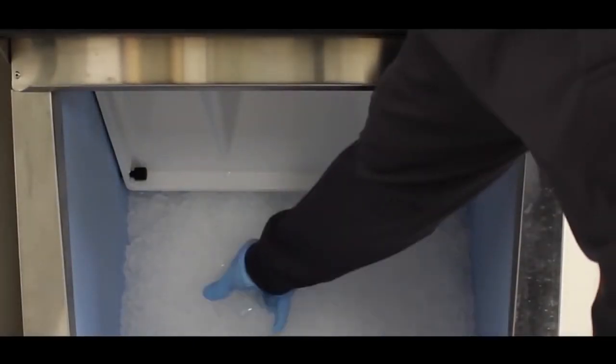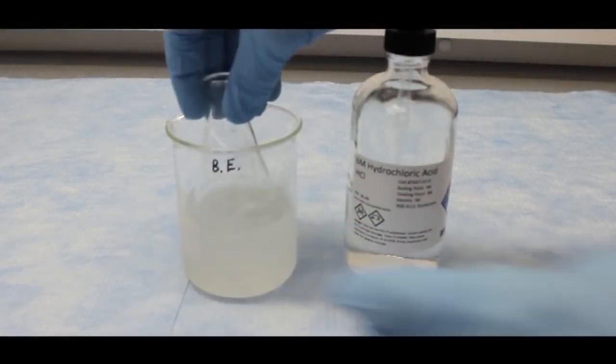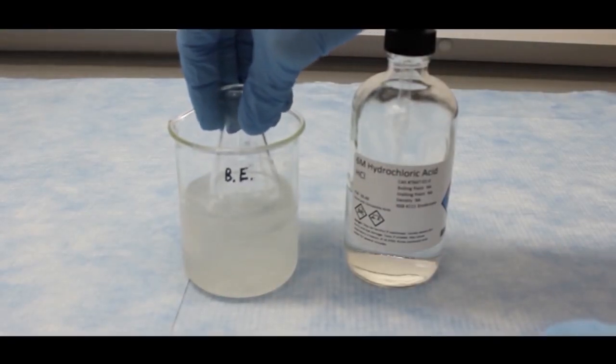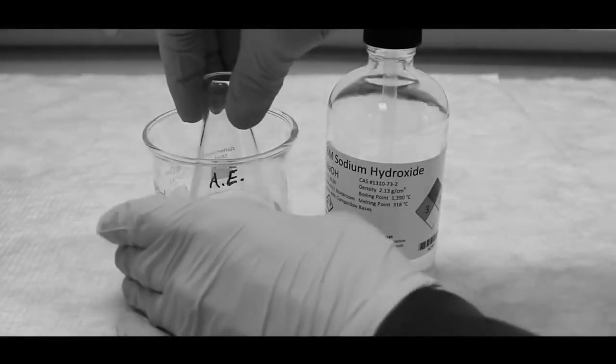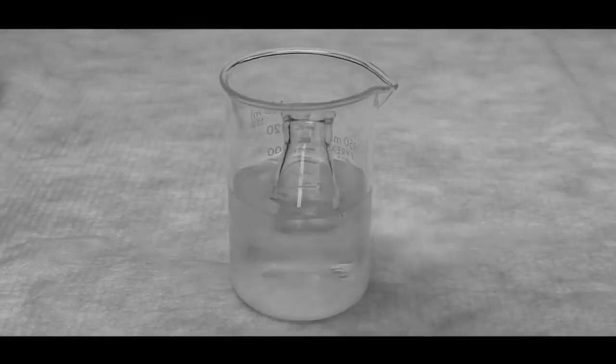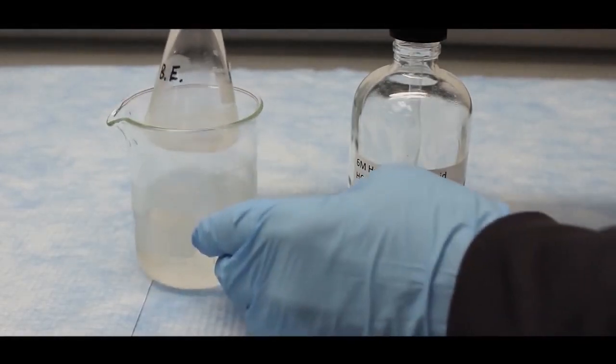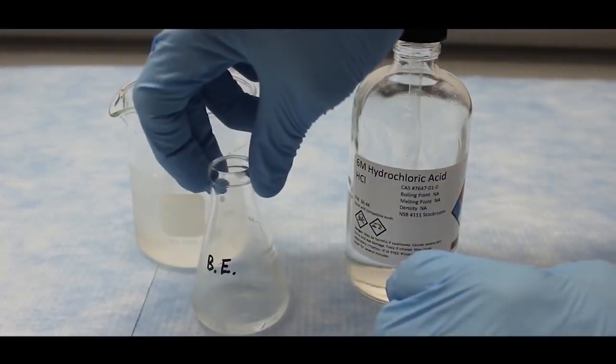I will grab some ice to cool the basic extract before addition of the HCl solution, since some sodium hydroxide is also present, and to minimize the solubility of the benzoic acid. For similar reasons, I will also start cooling the acid extract, and some distilled water to help during transfers. I will add some of the HCl solution and then take the flask out of the ice water bath so it can be seen easier.